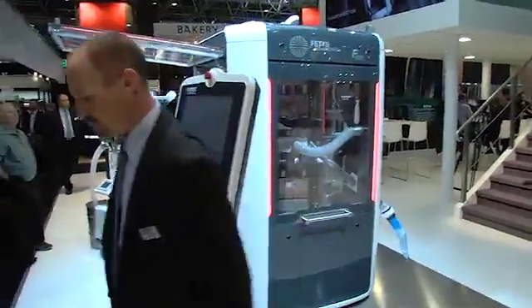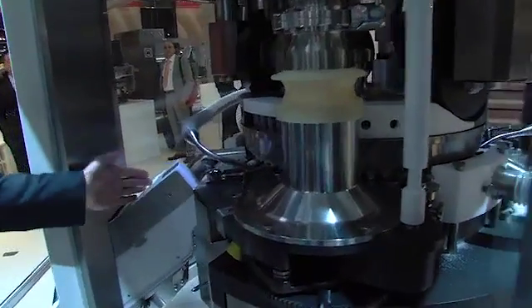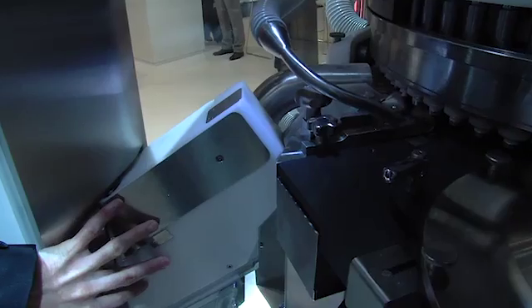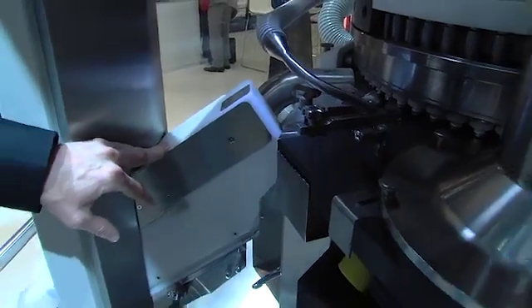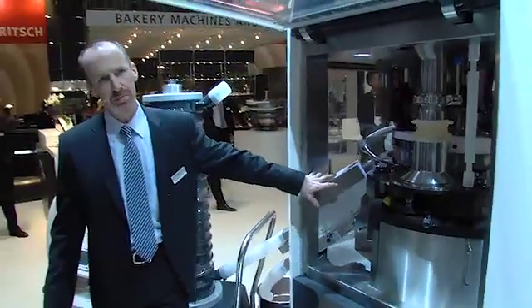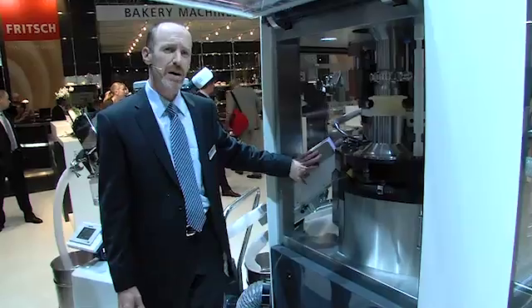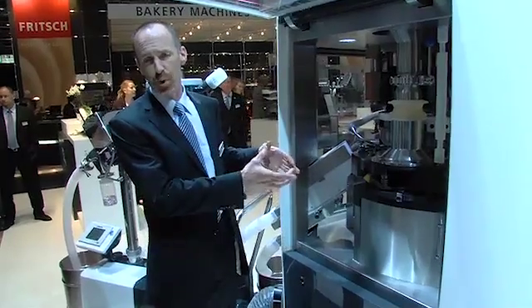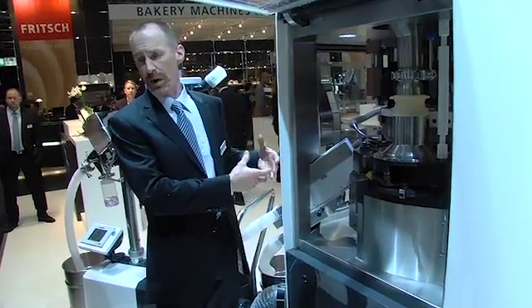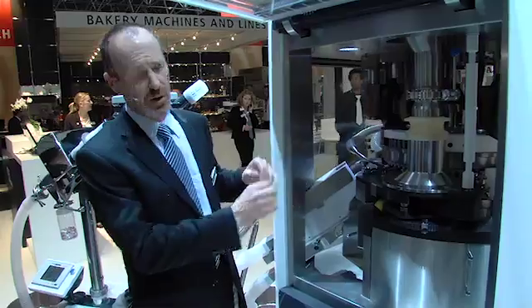Moving back to side one, and as we follow the logical compression cycle through final compression, one of the last innovations we will call attention to is the new discharge chute assembly. This discharge chute assembly actually incorporates three separate outlets into one simple, easy-to-clean mechanism with no tools required. All product contact components within this assembly are also stainless steel. The diversion mechanism for moving tablets — either a sample or an out-of-specification tablet — is achieved via an ingenious cam-mounted eccentric diverter.